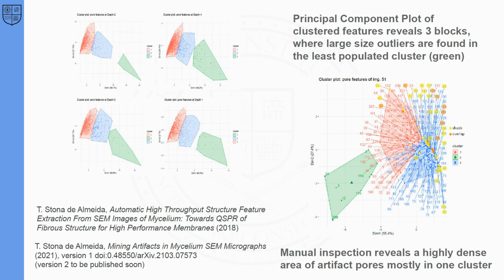When I compared the principal components plot of the clusters, I realized that there was a pattern, and it was acceptable to pick pore area and pore roundness as two sufficiently independent features that explain the PC plot and the clusters. Adding the labels to the plot, I could retrieve which points corresponded to the artifacts, and most artifacts were found within a small area that roughly corresponded to very small and round pores.